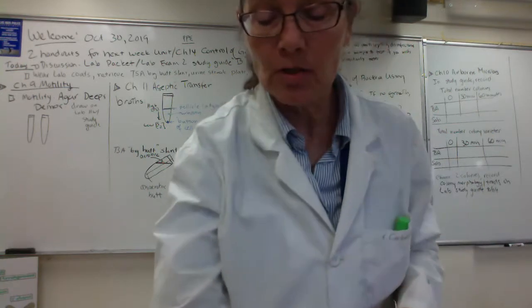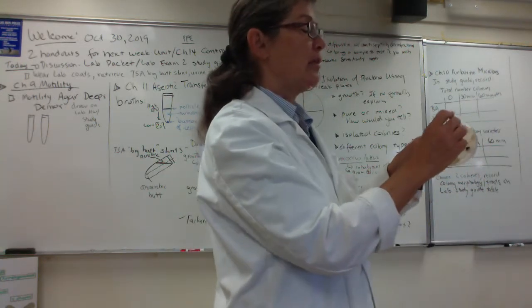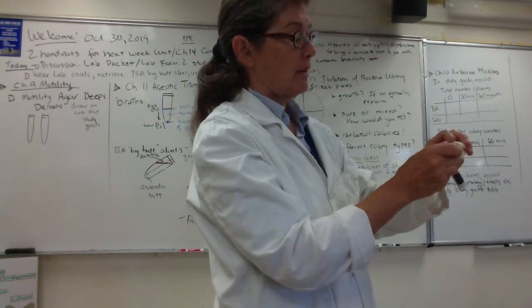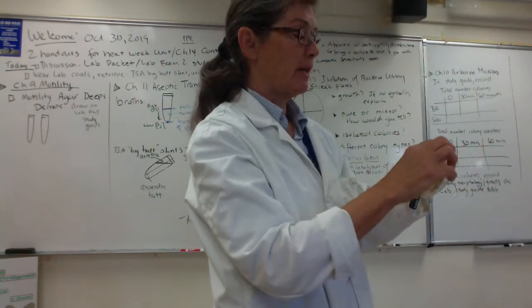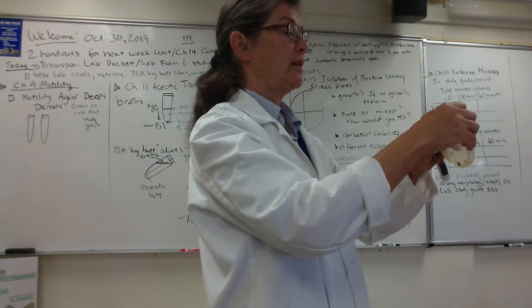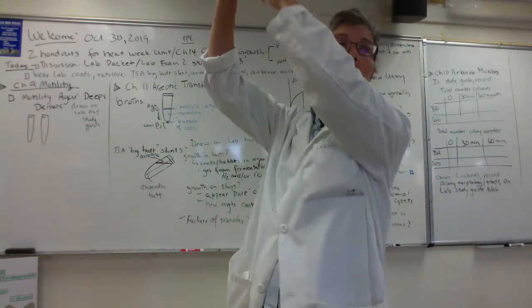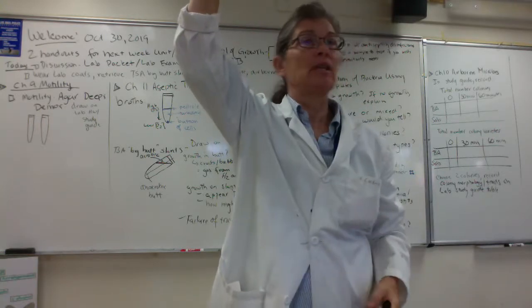And again, folks, it's really important. If you have tape labels on the bottom, it's really important that the tape doesn't cover up colonies. So what I would suggest is remove the tape from the bottom and put it along the side of your plate, because you want to be able to hold up the plate to the light. You want to look at it from the bottom of the plate, and you want to flip it over and look at it from the top of the plate.